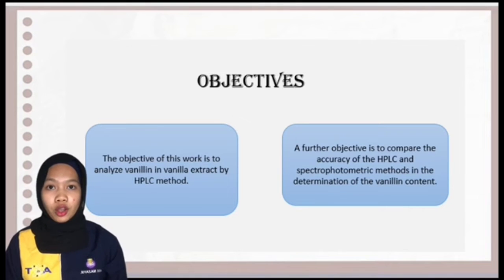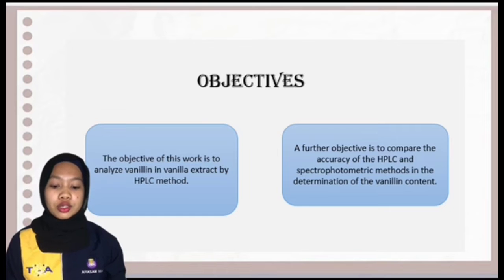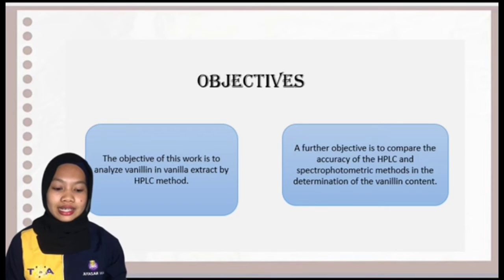The objective of this work is to analyze vanillin in vanilla extract by HPLC method. A further objective is to compare the accuracy of the HPLC and spectrophotometric methods in the determination of the vanillin content.